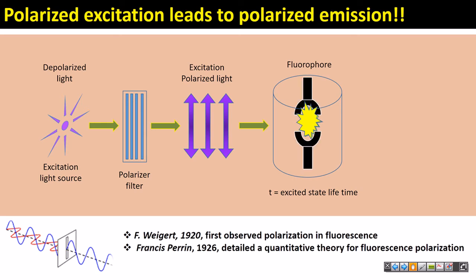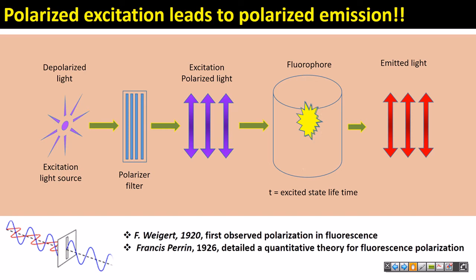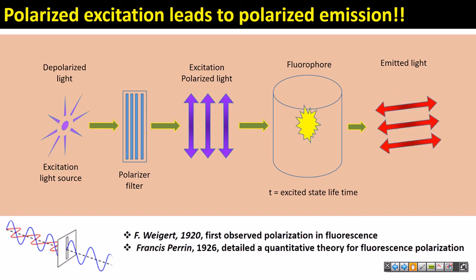So suppose that your molecule is fixed over there in the solution, held by some tweezer. You will get the same plane of light in emission, at a different wavelength. However, in natural conditions, in solution, that is not possible. Your molecule will be moving in the solution due to Brownian motion.